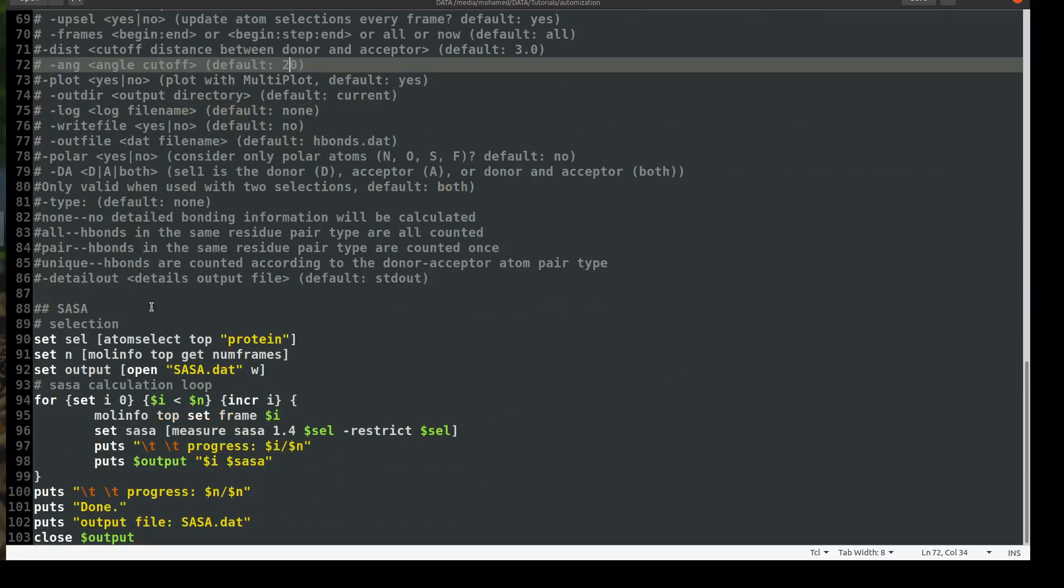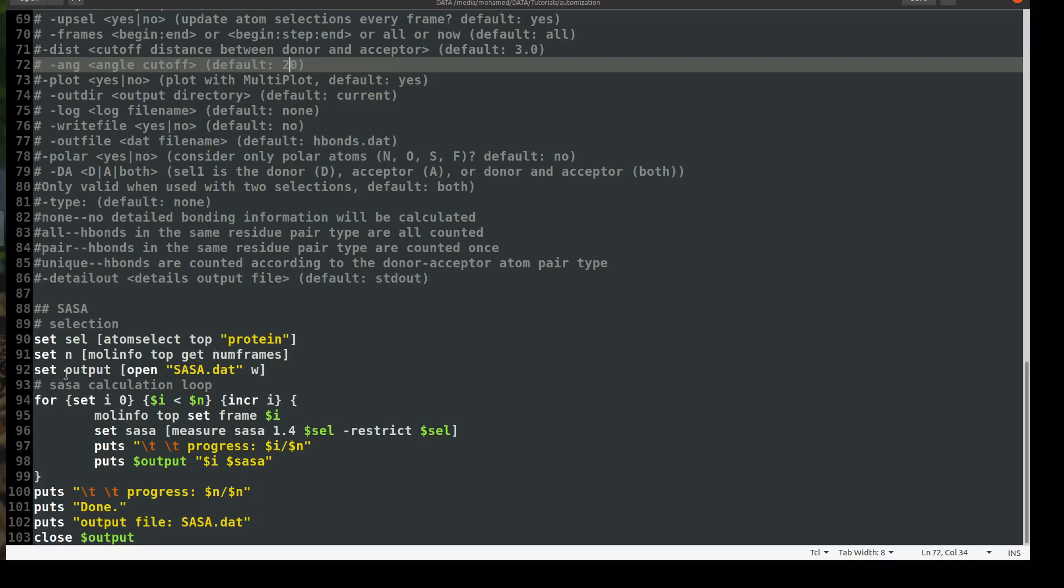So the new one is the solvent accessible surface area which, I don't want to extend the video, we already have a single video which was dedicated only to the SASA analysis so you may refer to it to know what is SASA and how to make it. But it's just very simple as the previous analysis. You set a variable called sel and you get your selection which is protein, and then you ask VMD to get some information about your structure which is the important information is the number of frames, and then you will assign an output file called sasa or whatever you want in the opening and in writing format mode, and then our very traditional loop. I don't want to go over it.